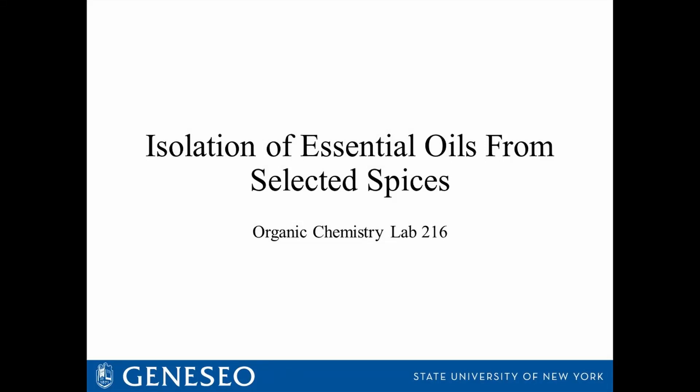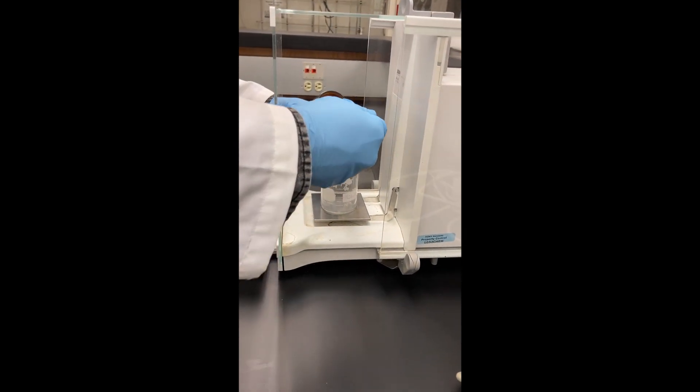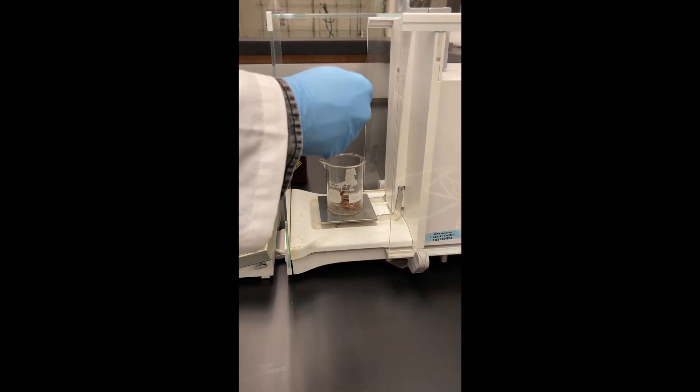Hello everyone and welcome to the Essential Oil Extraction Lab. In today's video we're using cinnamon as our spice. We'll begin by recording 10 grams of our spice.